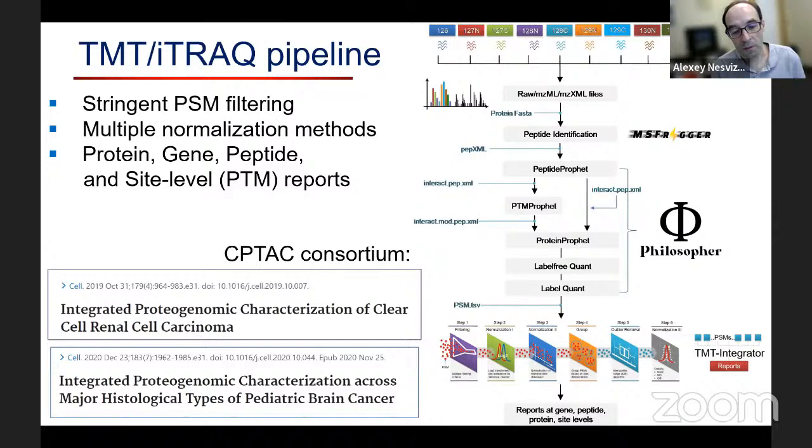And in fact, we are working with many groups. We have a paper published in Molecular and Cellular Proteomics just a month ago in collaboration with Kerry Bacchus lab at UCLA, where they extensively compared IonQuant against Skyline and benchmarked the tools against each other. They used Skyline a lot, and they benchmarked IonQuant, and both tools work well.